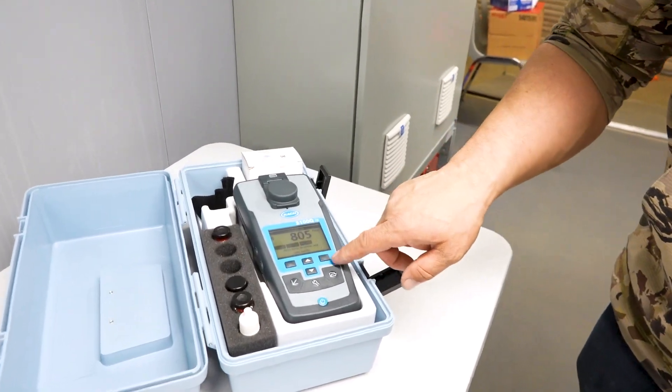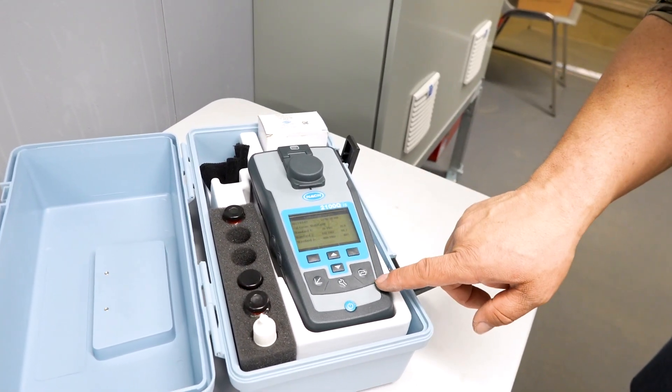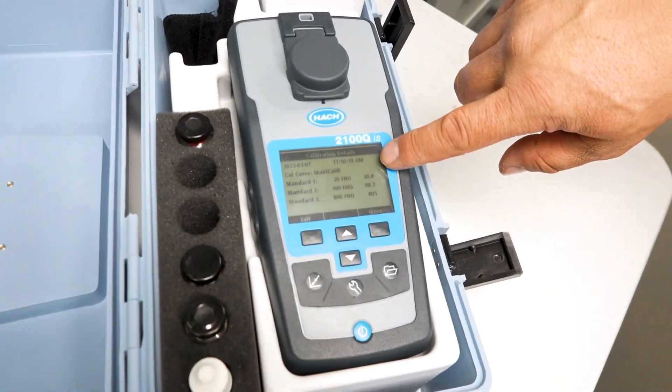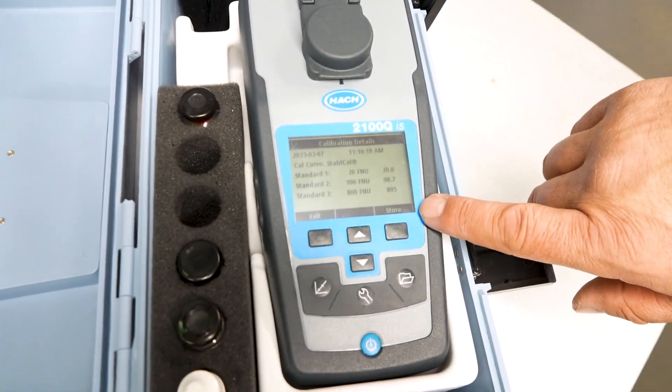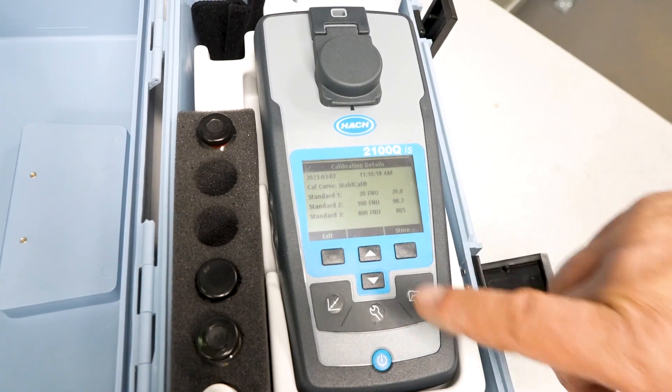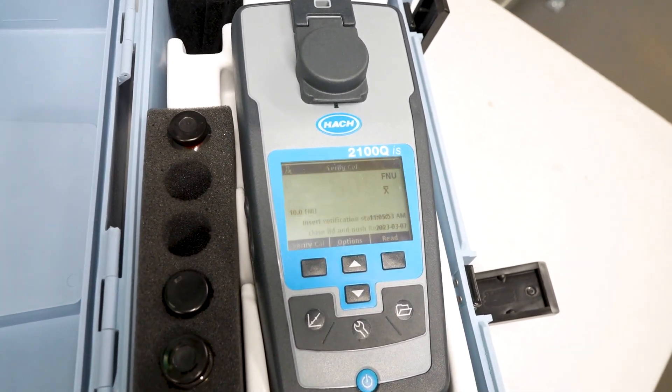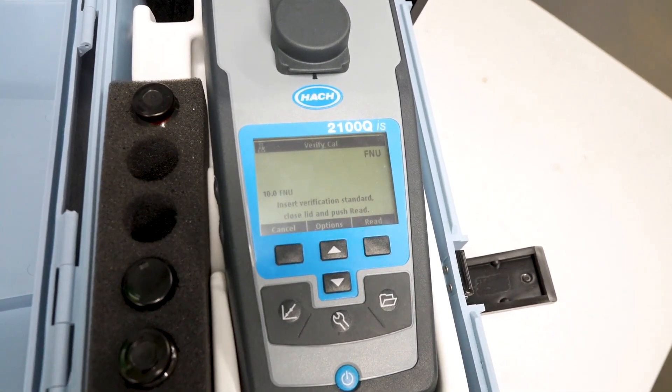Once we've got the calibration done, we hit done. And we always want to store our results, we hit store, and you can go through what everything was reading. Now we hit store, so it archives it into your unit, and then we are on the home screen again.